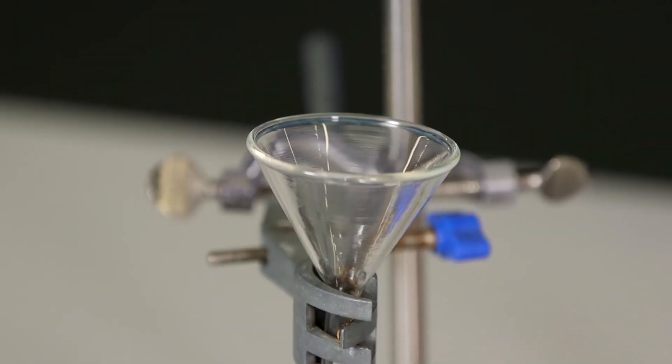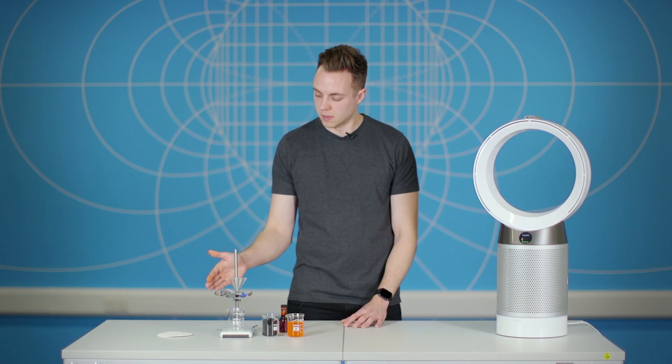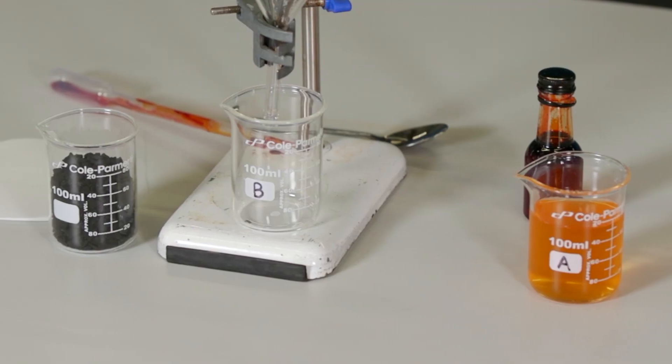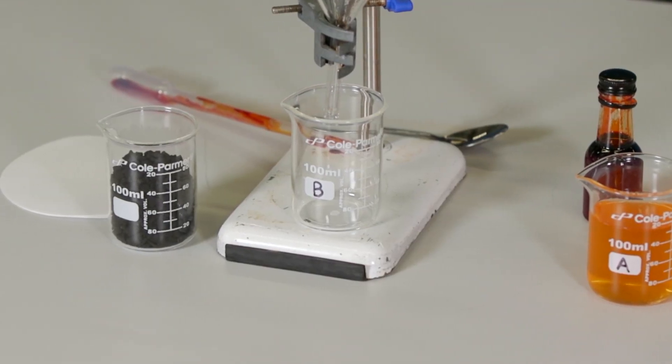Now, what I've got set up in front of me is a clamp stand holding a small glass funnel, some circular filter paper, which I'm going to place inside the funnel, and an empty glass beaker underneath to catch the water we're going to pour through.